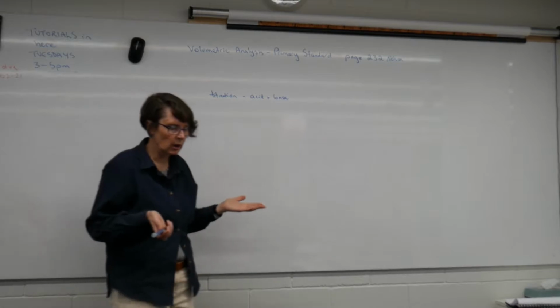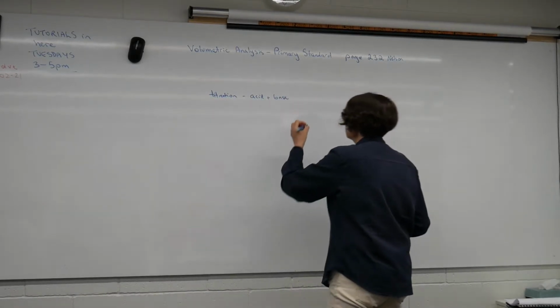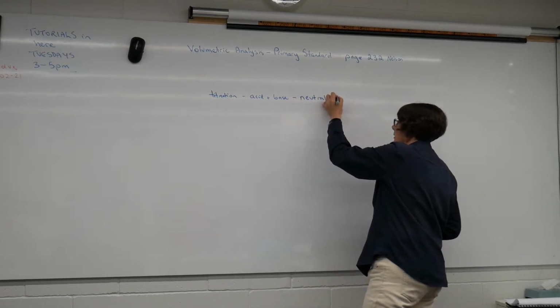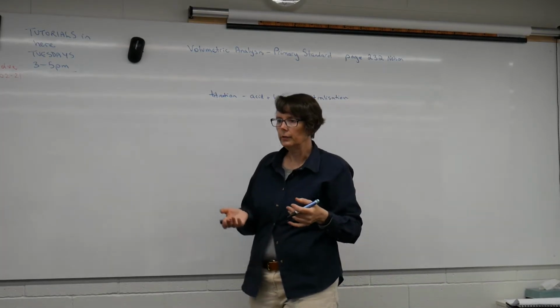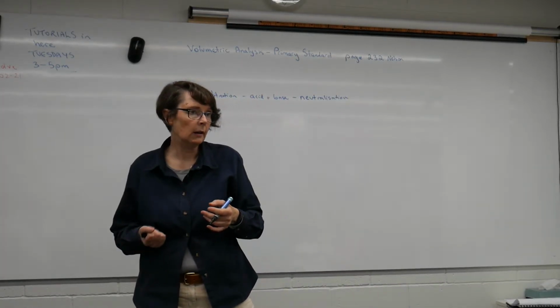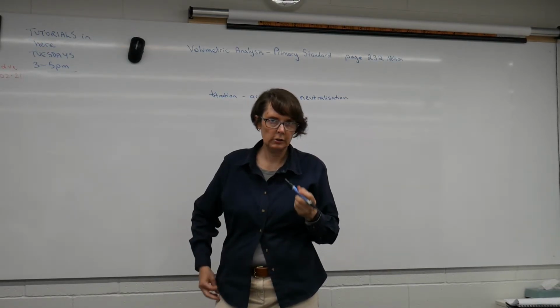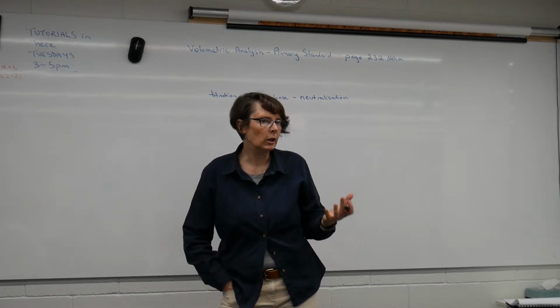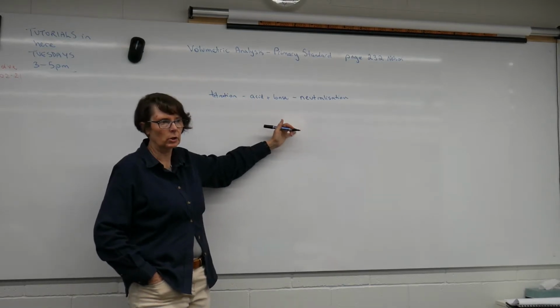What's the reaction type then? What do we call that? Neutralization. Yeah, so a neutralization. And we know that we used phenolphthalein indicator for our previous titrations, so for those of you who did the titration competition. And you know it changes colour to indicate that this neutralization reaction has occurred.